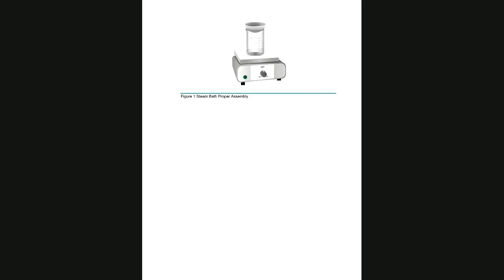So basically, you are going to have the copper there, and you're going to set up like that. You transfer the solid to this evaporating dish, and you put it in this setting, in a steam bath, and all you want is to dry the copper, because you need to weigh the copper.